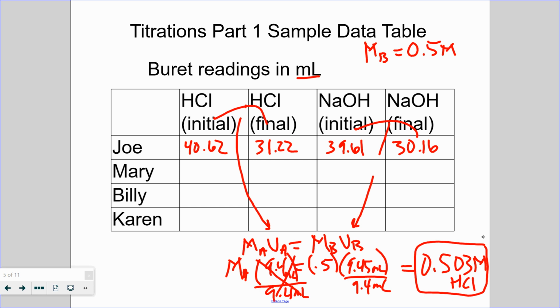Well, actually, normally we would do another kind of titration called a mass titration, where instead of keeping track of volume, you'd be keeping track of mass. In this case, I don't think we're going to do that. And then lastly, I would give each individual an unknown. You would have to make your own solution to titrate it against, and then titrate your own solution. It's the one lab in this class that you do all by yourself. That's one thing I really loved about it, and that's why it took 3 days. So I'm going to try and get this down to something a little bit smaller than that.